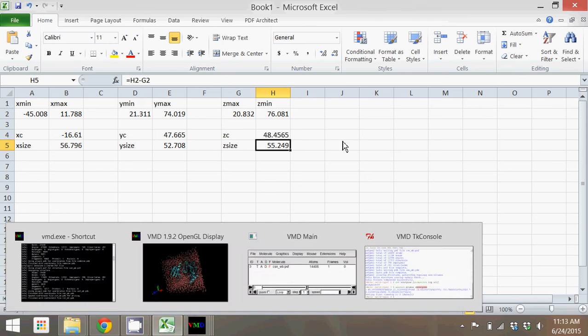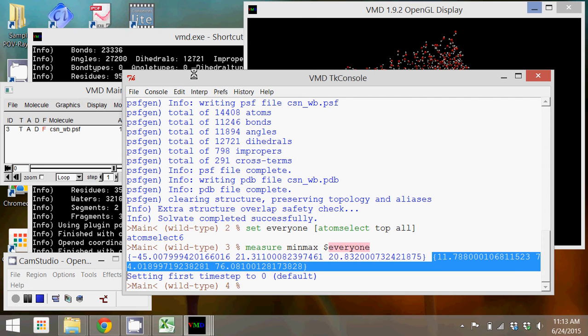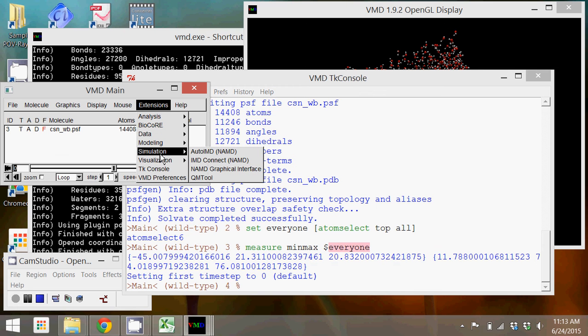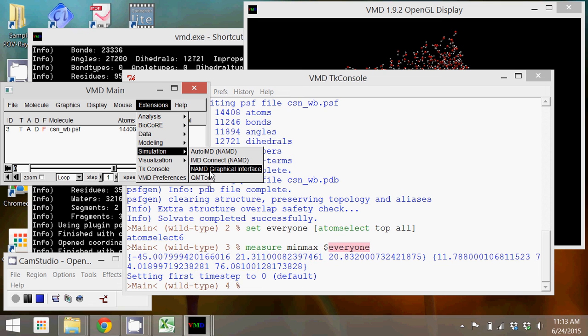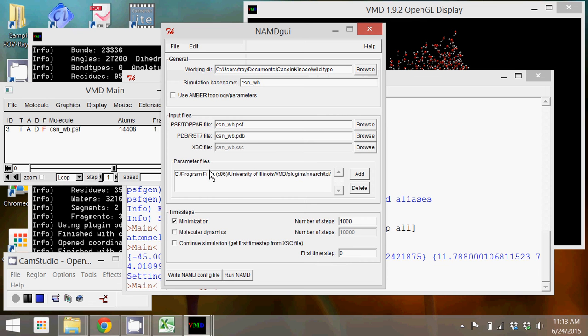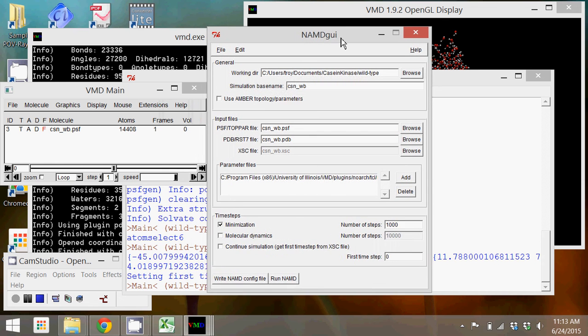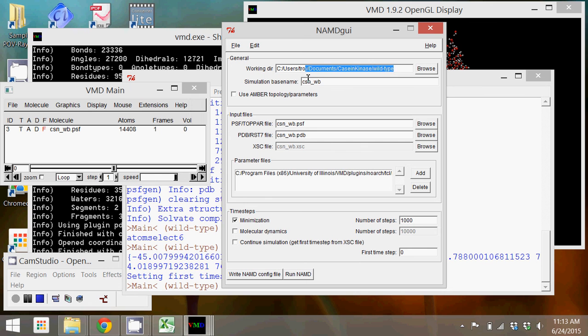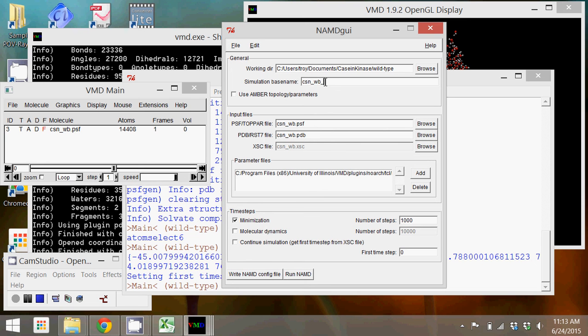Once we have those, we're going to go back into VMD, and we're going to go into the extensions menu, and under simulation, we're going to open the NAMD graphical interface. It puts us in our directory that we've already changed to in the console. I'm going to add to this not only the waterbox, but I'm going to add an MD for molecular dynamics to the simulation base name.